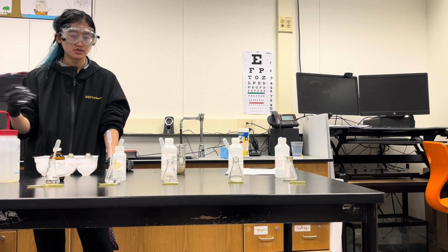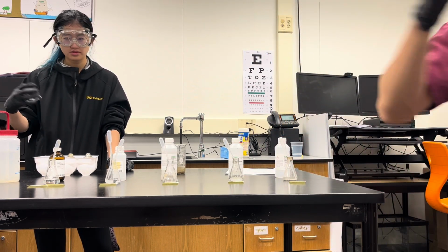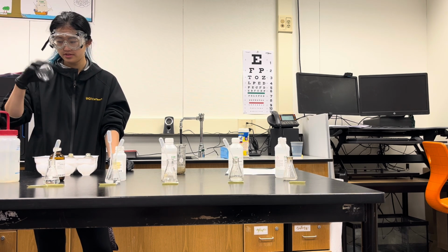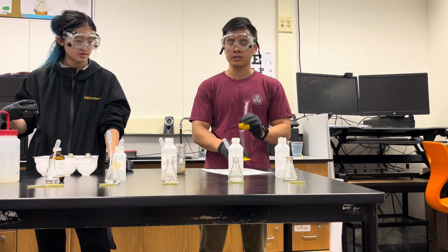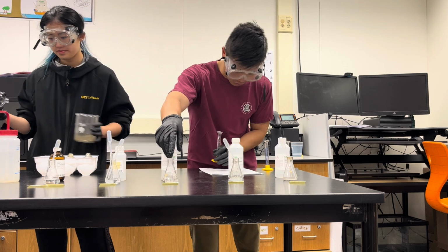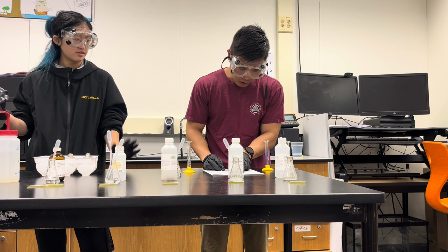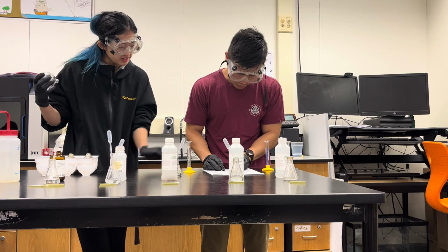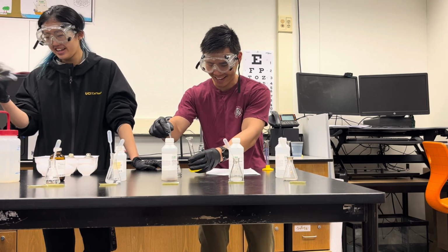All right, so while this is drying, we have a graduated cylinder. I'm actually gonna get another graduated cylinder. We need 3. And I need 3 different things. One is dextrose. So I'm gonna take my dextrose and, if you look at the instructions, it says 2.5 milliliters of dextrose. Never mind, 5 milliliters of dextrose. I did this so many times yesterday.